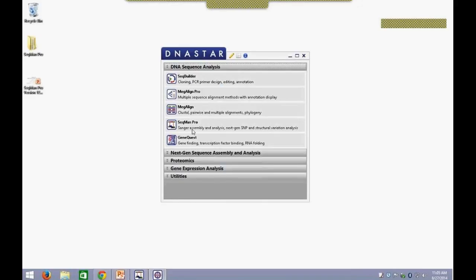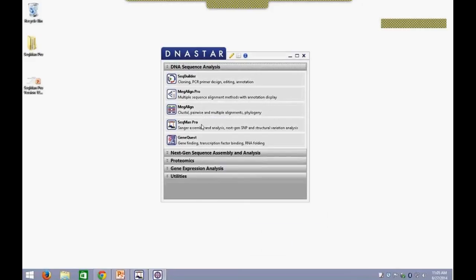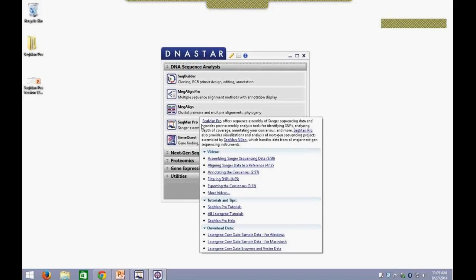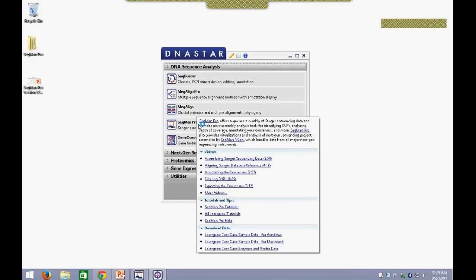For today's webinar, we'll focus on SeqMan Pro for our Sanger Assembly and Analysis. This program is one of the most powerful programs that we offer, as it can also import Next Generation Sequence Assembly files from our SeqMan Engine Assembler for Next Gen Sequencing. So with that, I'll go ahead and open SeqMan Pro.